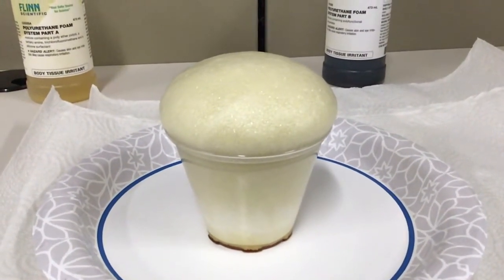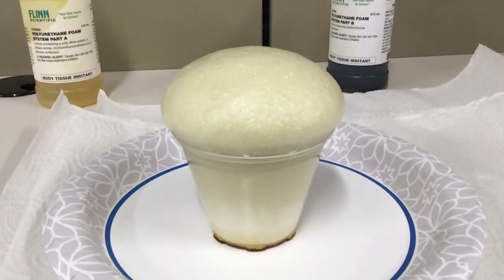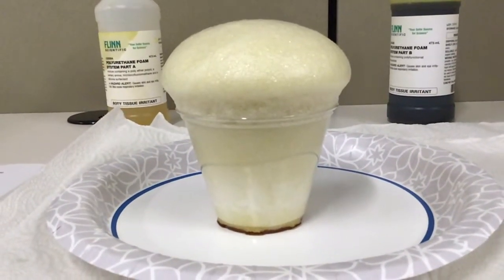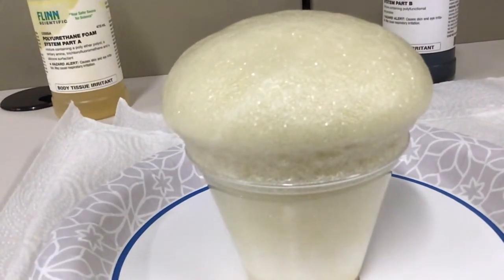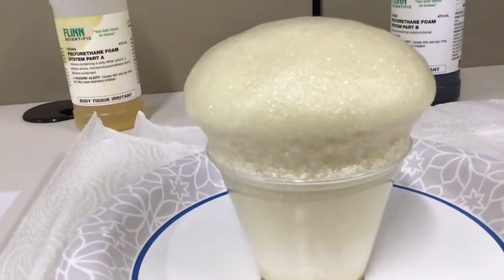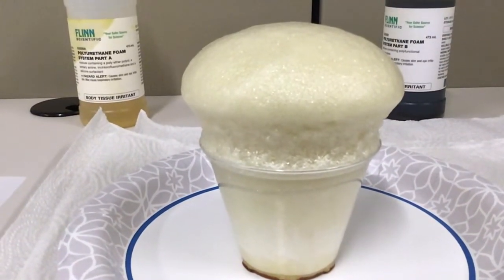So you can be working on completing the periodic table for those elements or recording observations at this point in time. I don't want to stop filming because this is obviously the important part of seeing the chemical reaction occur between solution A and solution B.